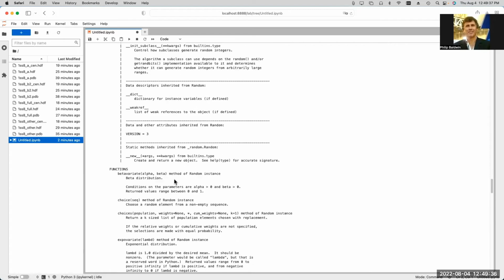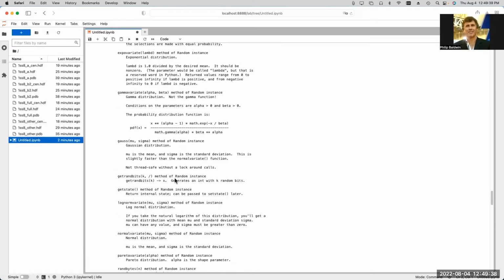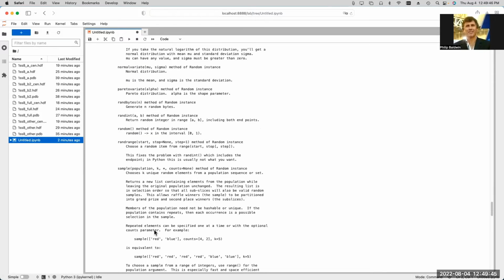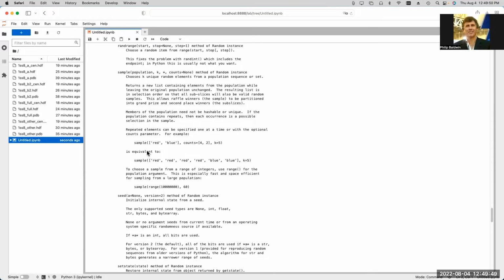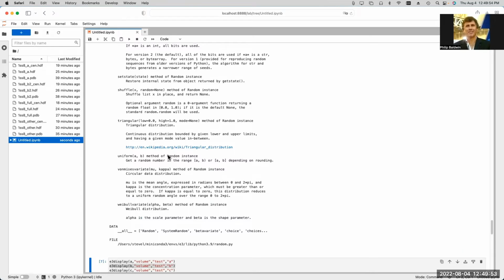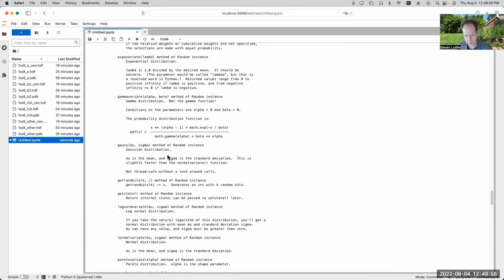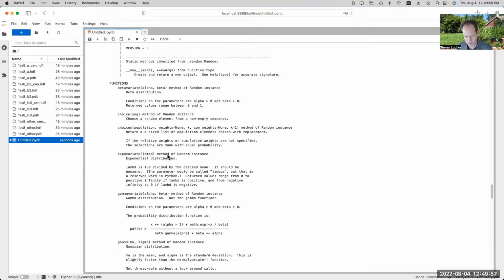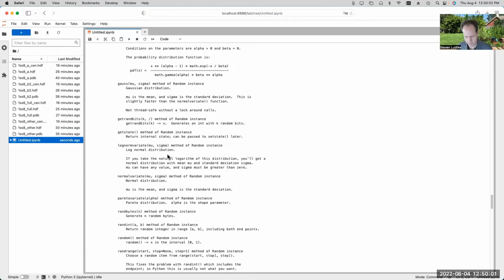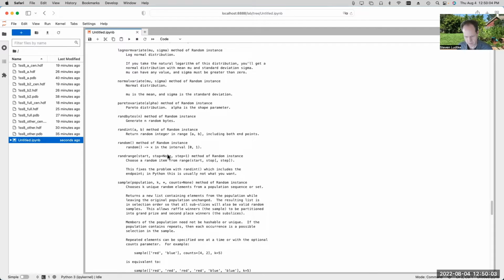Rand range. No, that's from a range. Sample uniform, maybe uniform. Yeah, we'll just do a uniform distribution. That's good. And I guess for the other one, we can just say random.